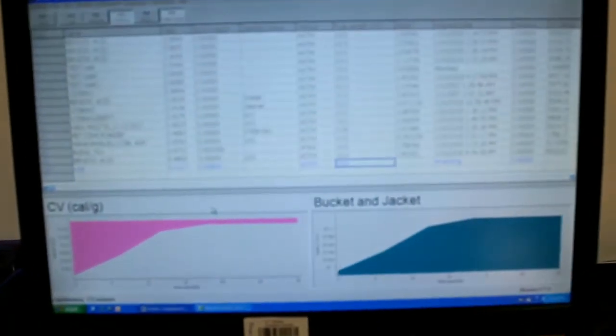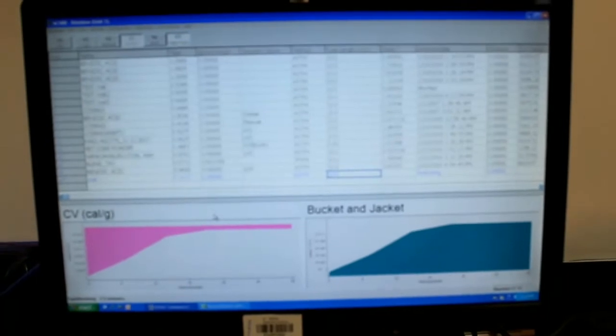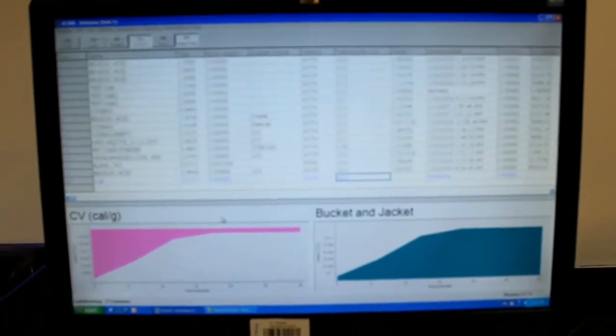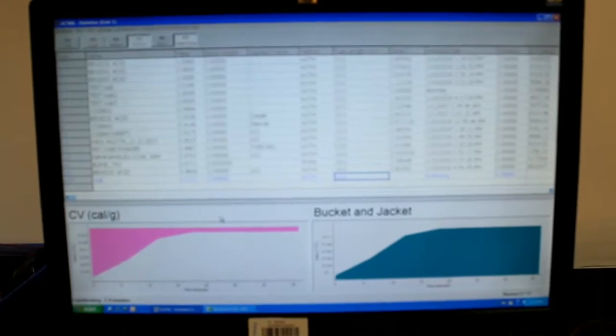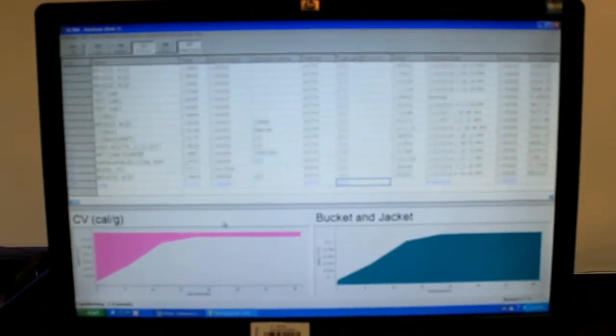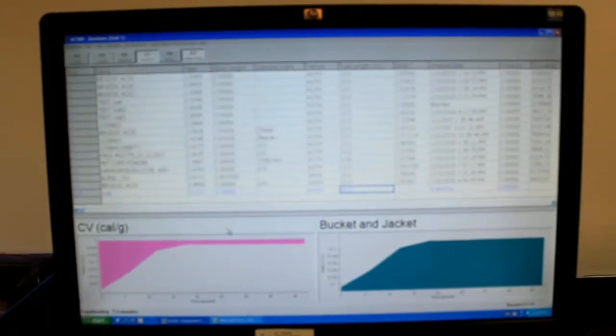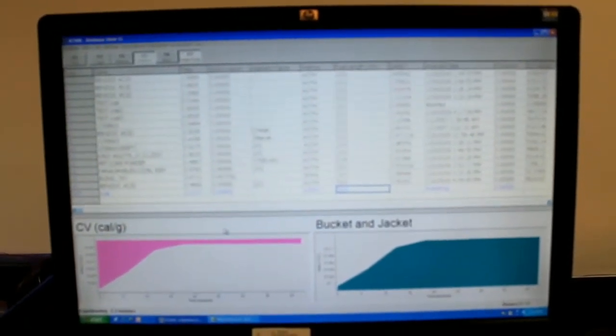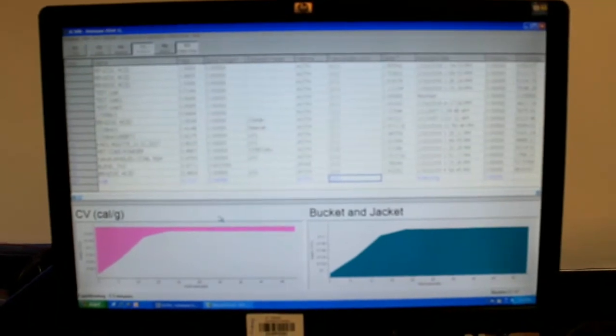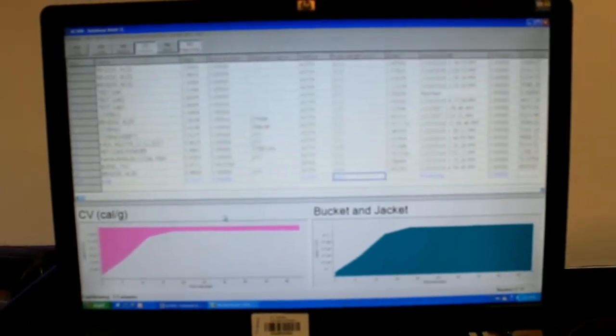The calorific value of the sample is determined by combustion of the sample in a controlled environment. Which I told you earlier, we have two thermistors in the instrument. One is used for bucket and another is used in a jacket. So in this 3 minutes, both the temperature it matches. That is, plus or minus 1 degree of tolerance.